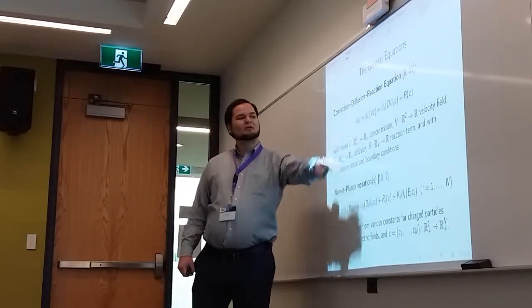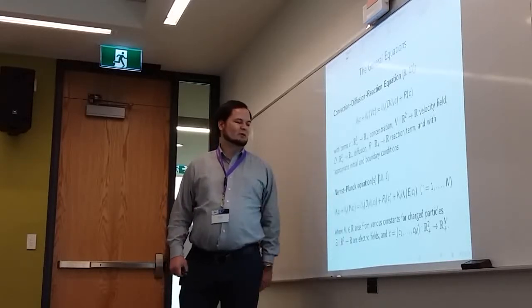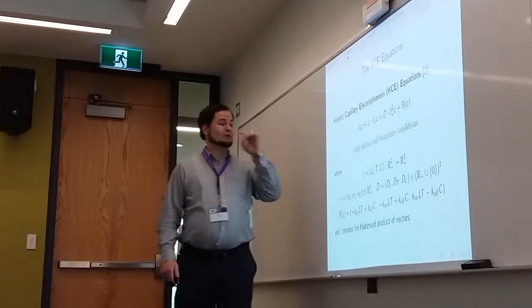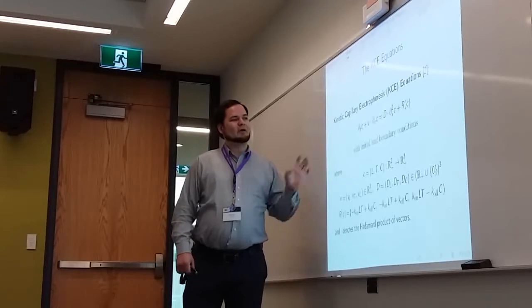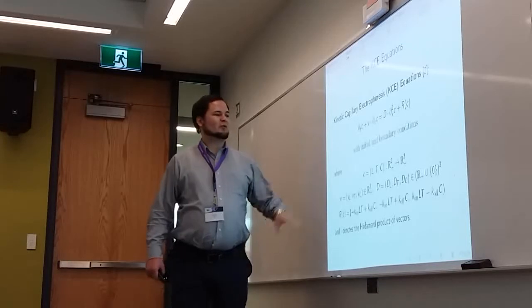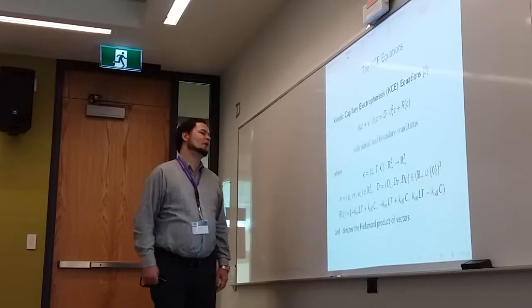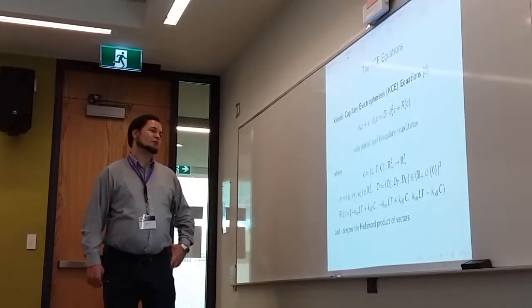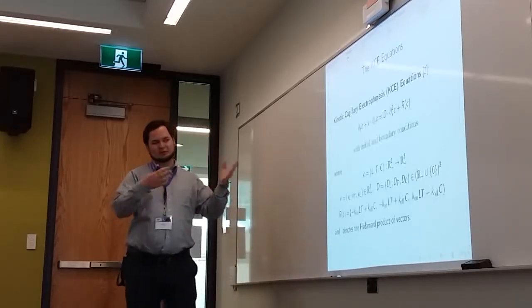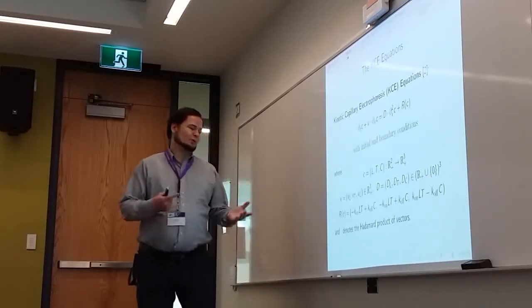At least this is the equation we start out with, and then we specialize that to the Nernst-Planck equation. That's an intermediate form, and then we get to the actual equations we need, which are the KCE, kinetic capillary electrophoresis equations. So this is actually a vector PDE, and we have a Hadamard product here. For KCE it's 3 lines of equations, but the algorithm that we developed actually works for multiple substances, more than 3.